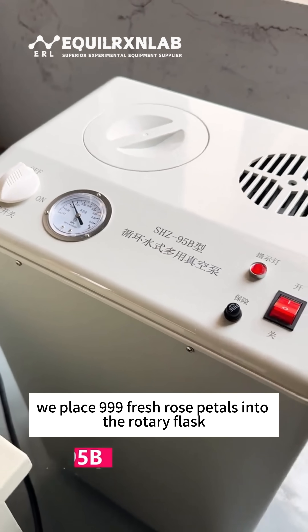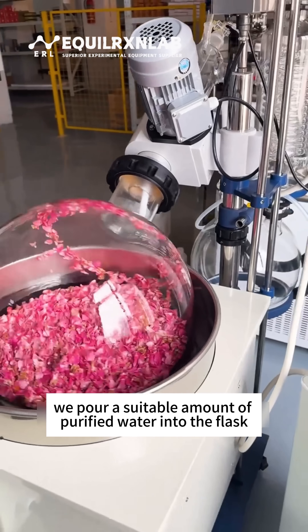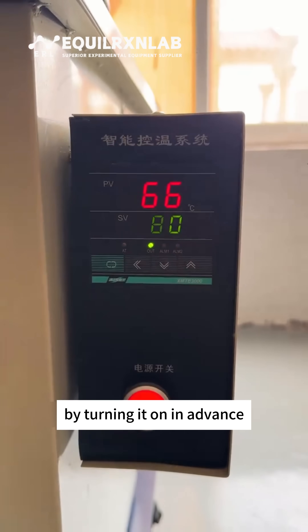First, we place 999 fresh rose petals into the rotary flask. Then we pour a suitable amount of purified water into the flask. Next, we preheat the water bath by turning it on in advance.